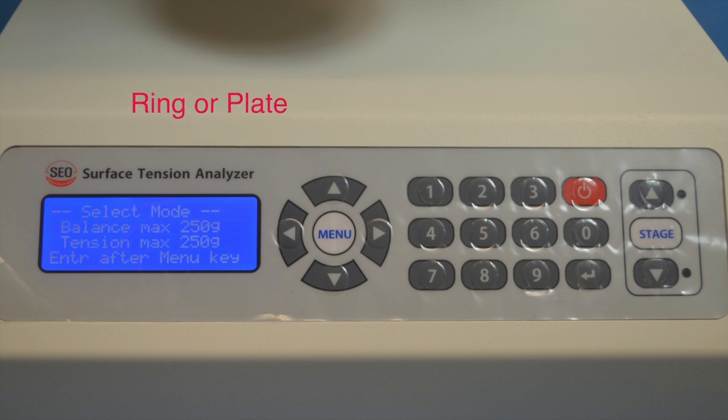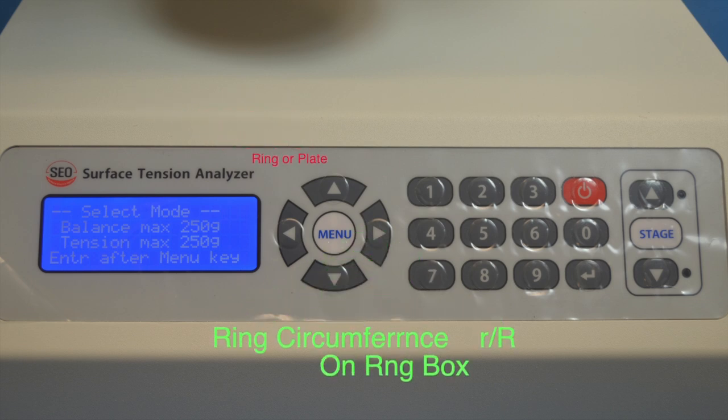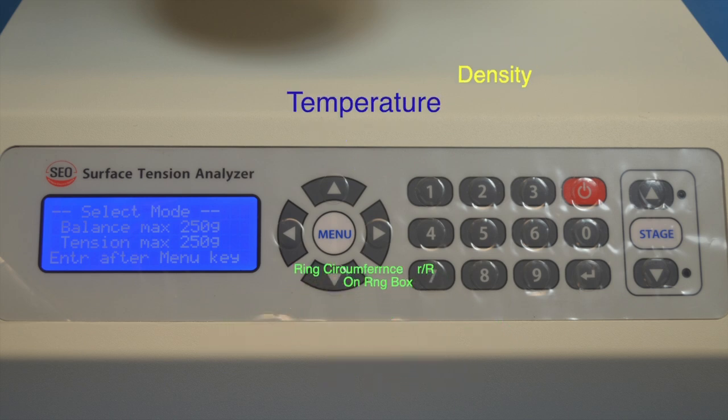The test parameters are ring or plate, the ring circumference on the ring box, the density of the product, and the temperature of the product.